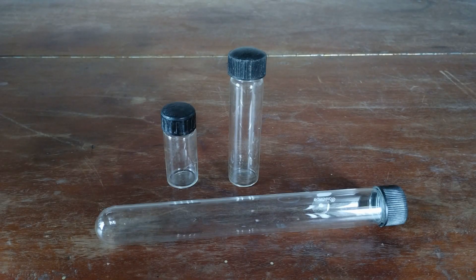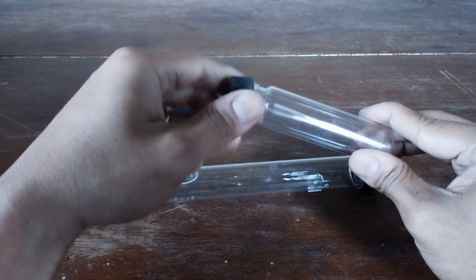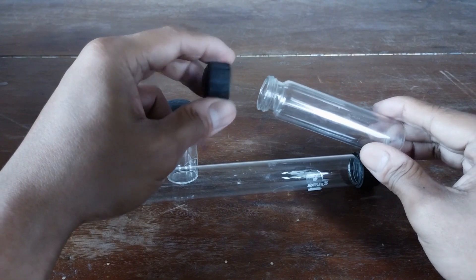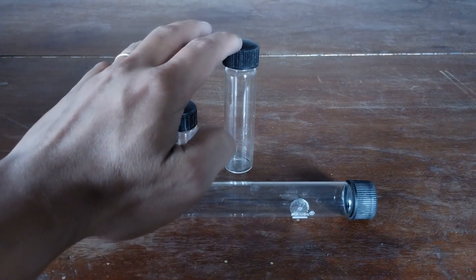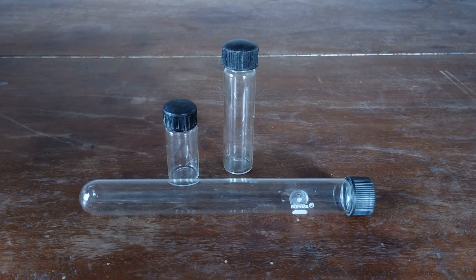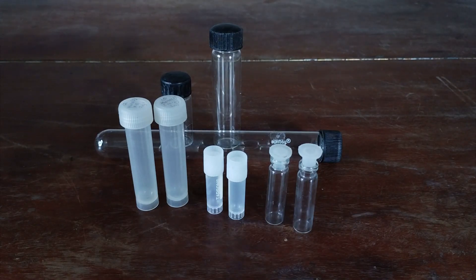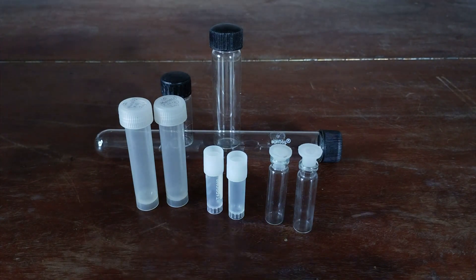Culture tubes are specially designed for use in microbiology and plant tissue culture experiments. They are basically test tubes with a tight-fitting screw cap usually made of bakelite, with an inner rubber lining to ensure an airtight and watertight seal. These are 15, 30, and 60 ml tubes, with even smaller ones also available commercially. Culture tubes are ideal for storing smaller specimens. Some other related examples are plastic screw-capped vials and glass vials with plastic stoppers — tiny tubes commonly used in biology for storing small biological samples.